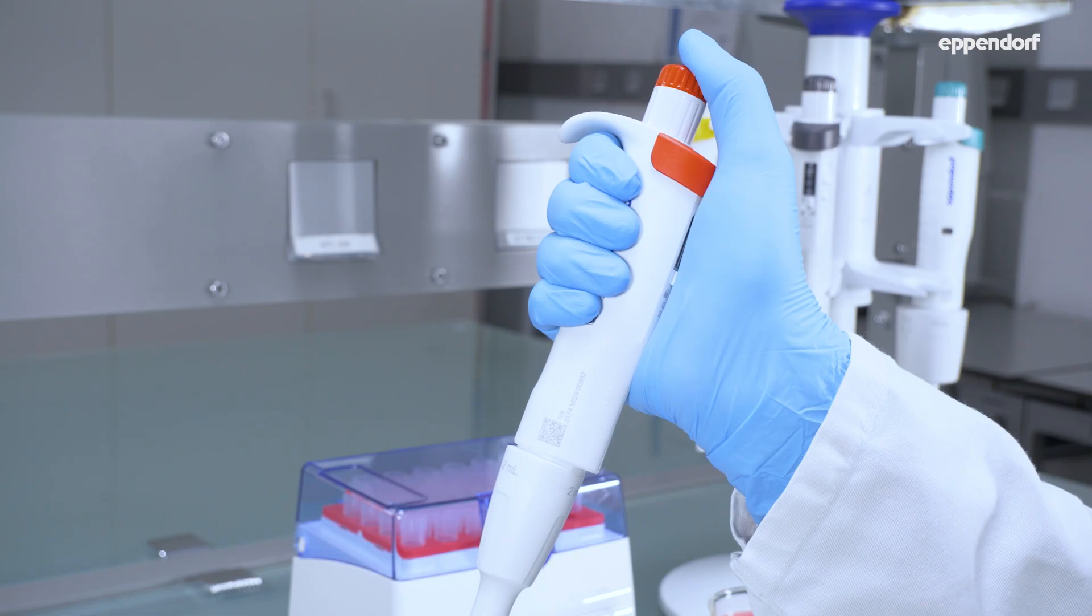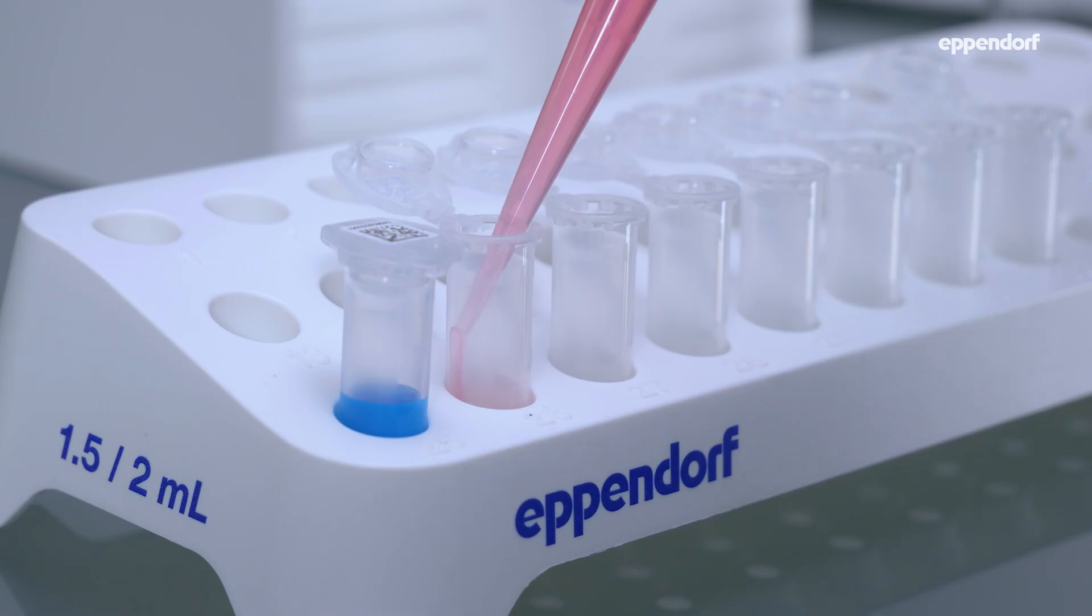Dispense the liquid into your target vessel by pushing the control button to the first stop. Don't blow out the tip, but pull it out with the excess volume still in the tip.